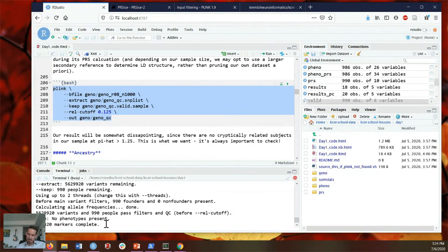So you can wait for this to complete if you'd like, but it would take a decent amount of time. We're only at 140,000 markers. It's definitely maxing out in terms of the core CPU abilities here. I'll take a look at a couple of questions.